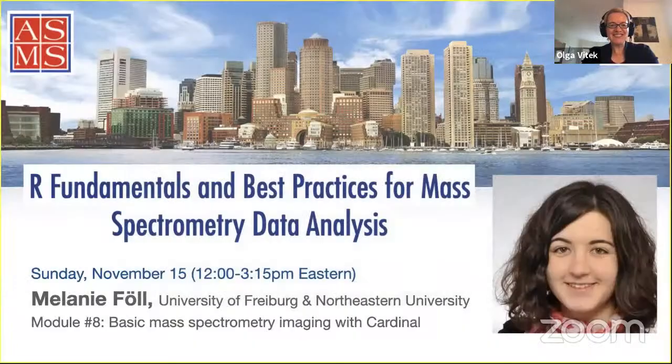Okay, here we go. So it is my pleasure to introduce Melanie Foell, who has a joint appointment at University of Freiburg in Germany and at Northeastern University. And so Melanie is an expert in Cardinal. And so I'm looking forward to hearing from Melanie about the use of the package.